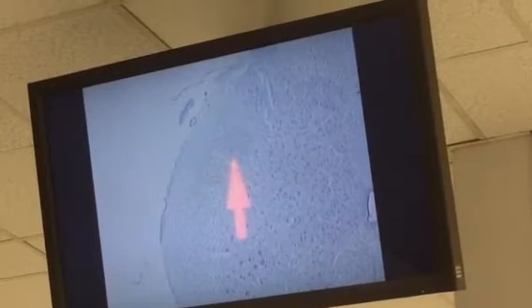Now, again, we can see the distinction between the gray matter and the white matter. The gray matter has a lot of cell bodies in it, particularly these large ones that we're going to zoom in on down in the ventral horn. The white matter is out here. And so it'll become clearer the different composition of that as we go up in magnification.